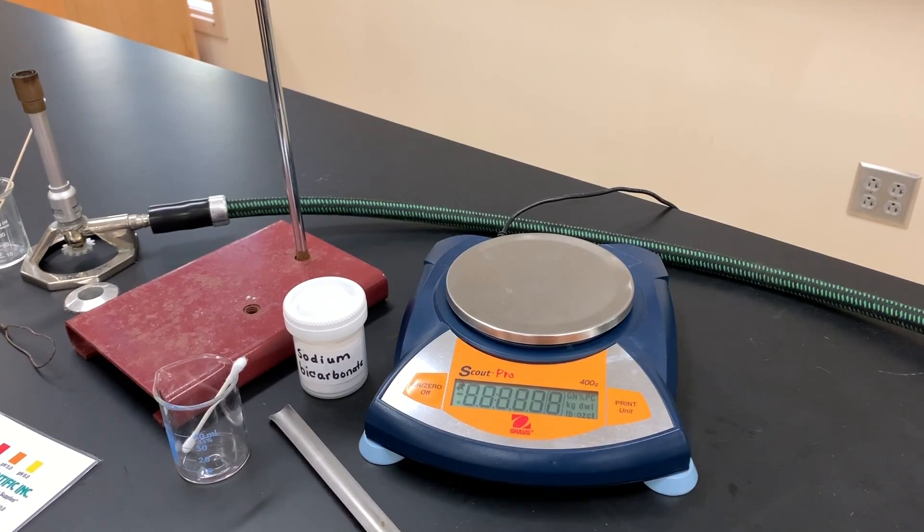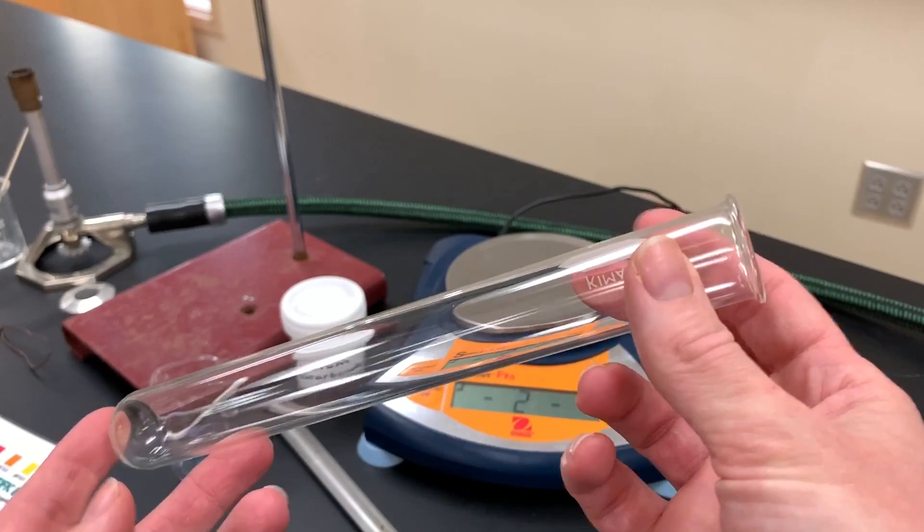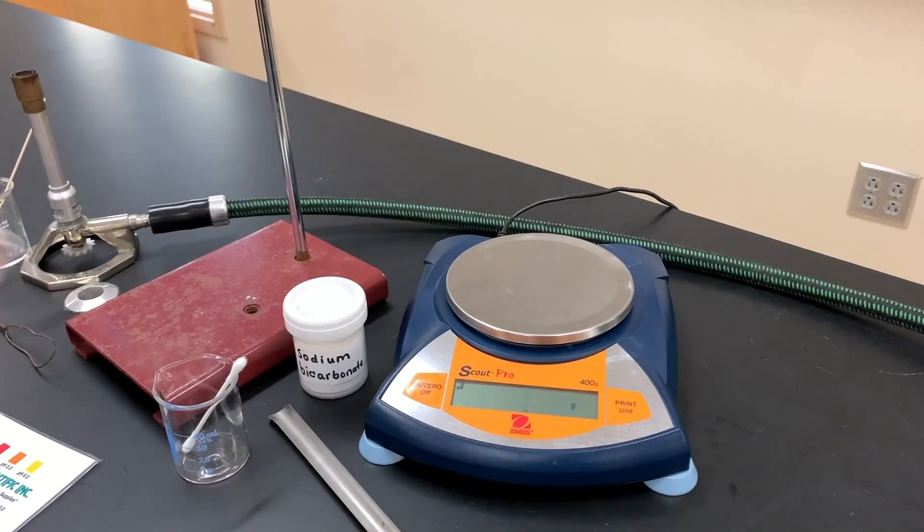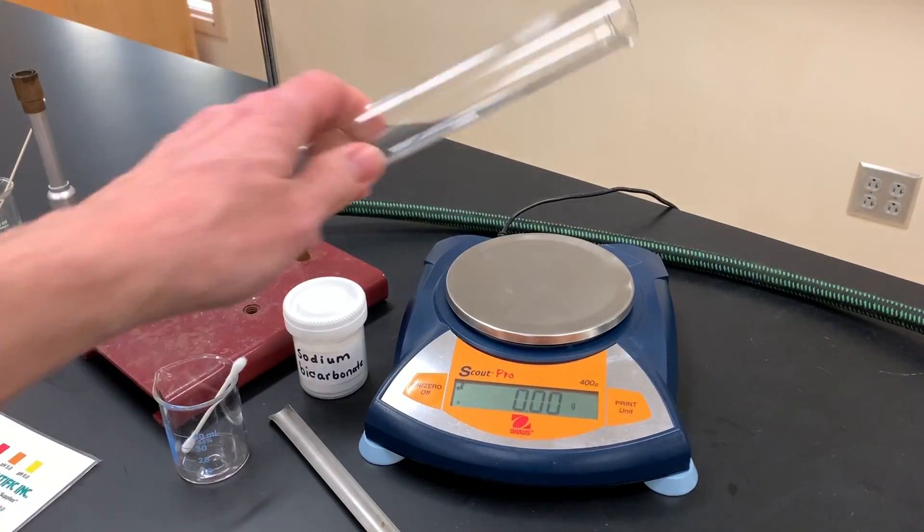The next thing is to have a clean dry large test tube. Once the balance is zeroed and it says grams as your label, you can place your test tube on there.